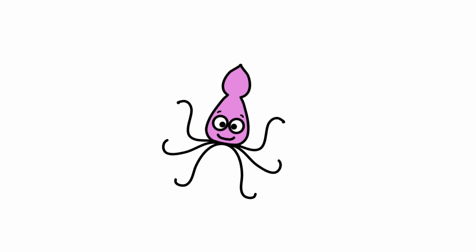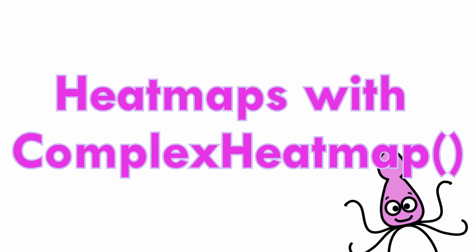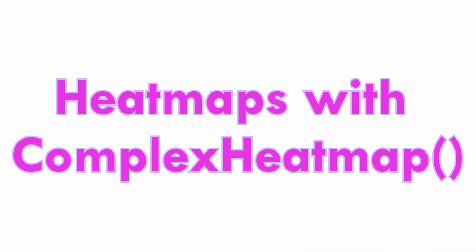And welcome back to Biostat Squid. In this video we're going to learn how to create and customize a heat map with our package ComplexHeatmap. So if you're ready, let's dive in.